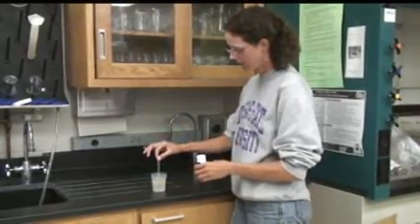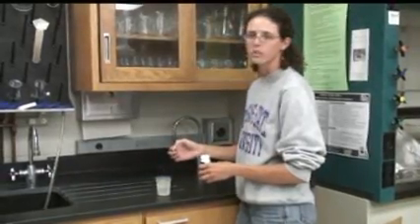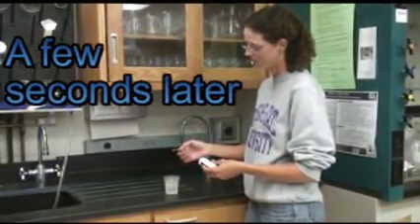Simply dip the strip in your water sample, pull it out, and hold it level for 15 seconds.